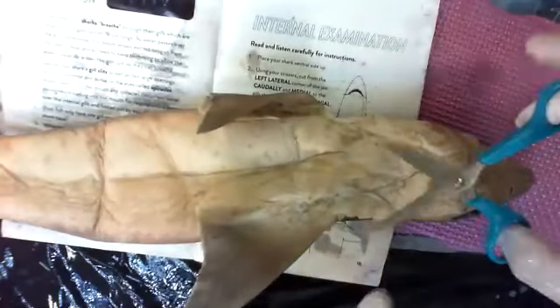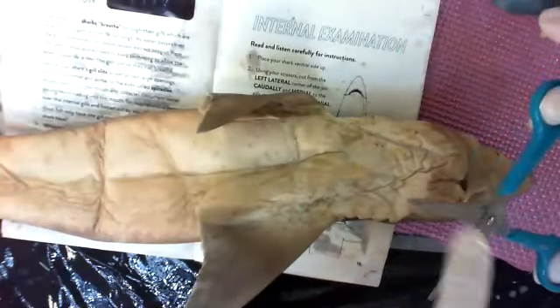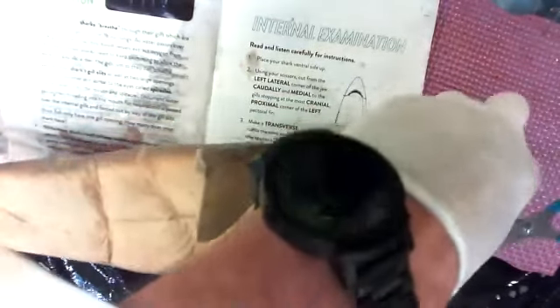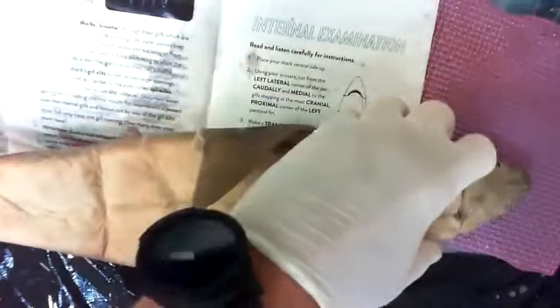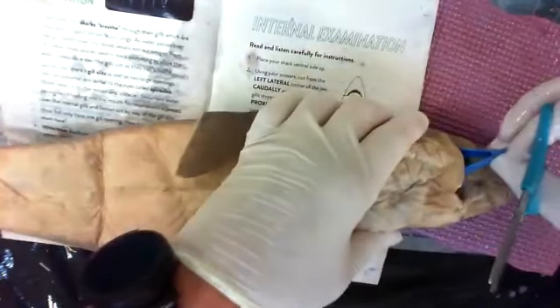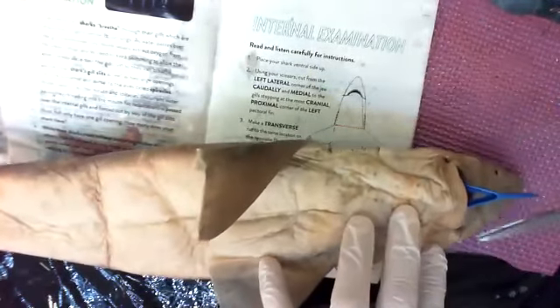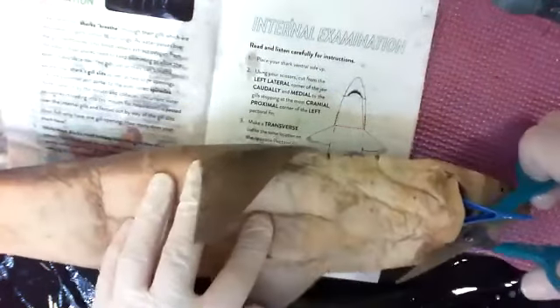All right. I'm going to flip my shark around because I'm right-handed, and it's better. The best way to do it is to slide the scissors in and bite with this part here for leverage. And I wish I didn't have this because I'm afraid I'm going to stick my sharp, pointy scissors into something I don't want to cut. So if we open this up, you can put your tweezers in there to hold the mouth open. I'm going down here. I'm looking for the corner of the mouth. There's the corner. It's crazy to think that's not bone that's making the jaw. It's all cartilage. We're going to see that in a second.